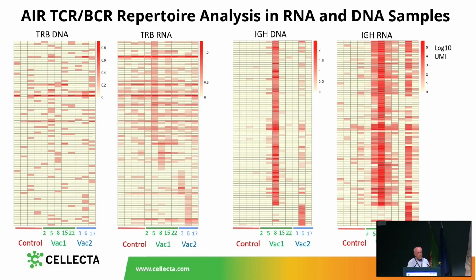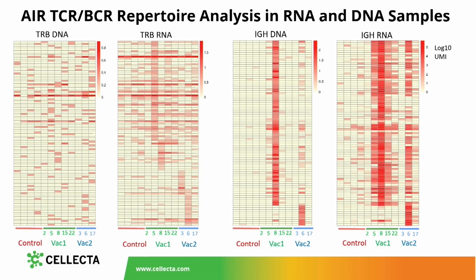So it's rather obvious when you do adaptive immune receptor profiling, AIRR-C, using DNA and RNA samples demonstrated on this slide, for the B-cell receptors, you can see a very strong activation at the same time, approximately 1 week after vaccination, at the DNA level of multiple clonotypes, which correlate with the RNA level. So it's indicated that we have both proliferation of the B cells and at the same time activation at the transcriptional level.